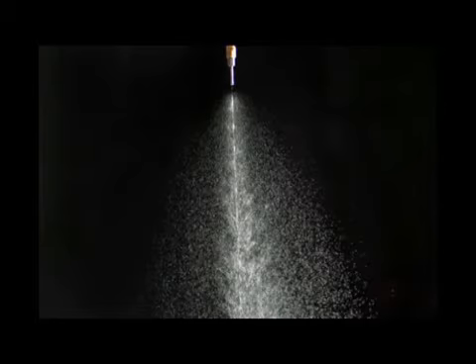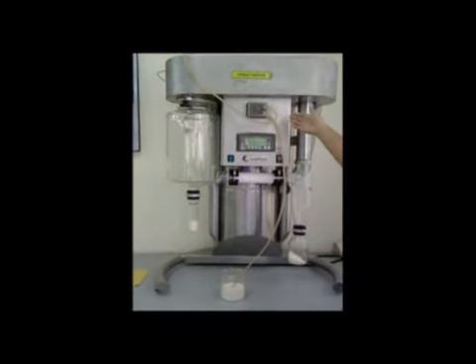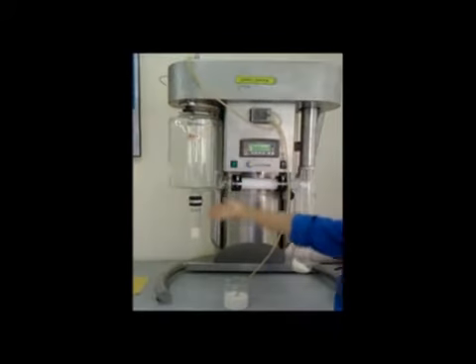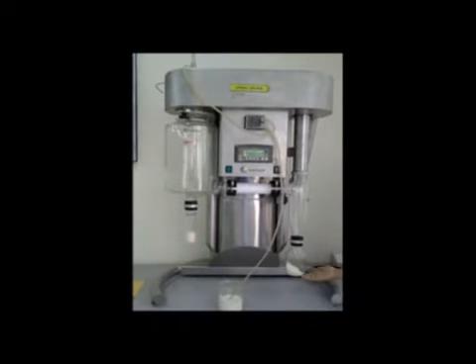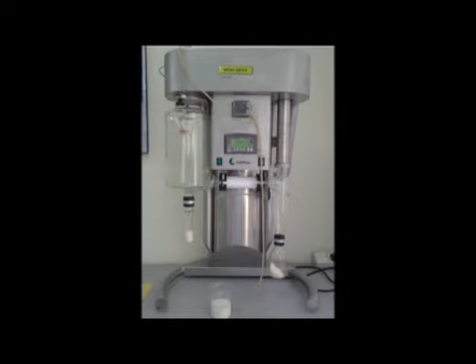Atomization is done through a pressure nozzle. The inlet drying air, after passing through the electrical heater, flows concurrently with the spray, where it contacts the liquid feed droplets, and the evaporation takes place in the drying chamber. Spray evaporation is rapid, and the temperature of the drying air is drastically reduced by the evaporation of water. Dry samples are collected from the base of the drying chamber. This process can be related to mass transfer.